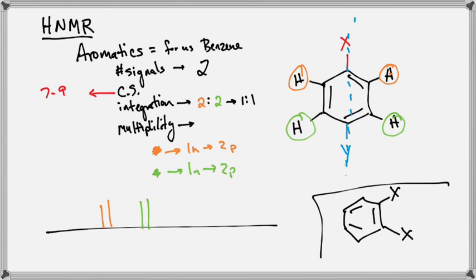Yes. Okay. The green hydrogens are interacting with the blue Y. And our orange hydrogens are more likely to interact with the red X. Therefore, the orange and green have a different chemical environment and therefore will show up as different signals.